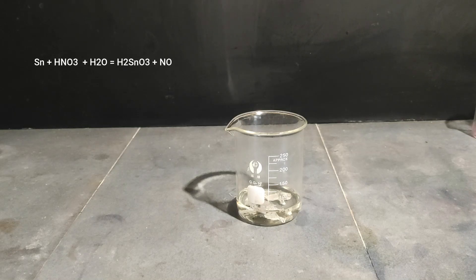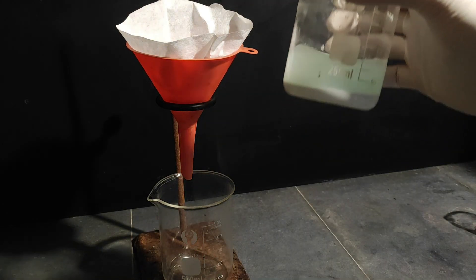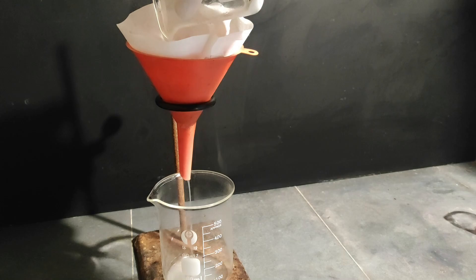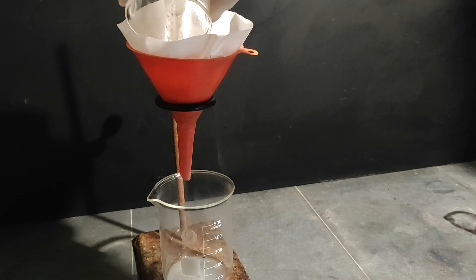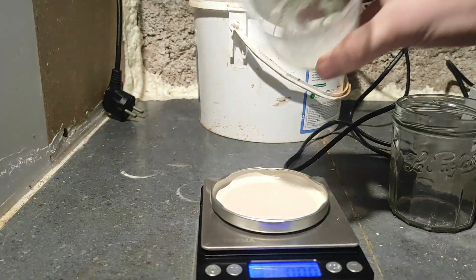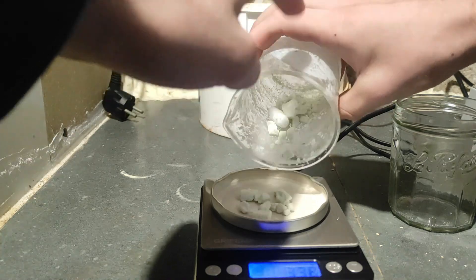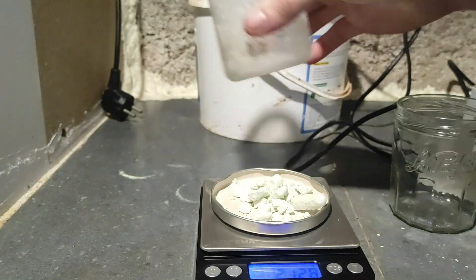The tin metal gets dissolved by nitric acid and forms a white insoluble solid called metastannic acid. The reaction is exothermic and produces lots of nitrogen dioxide gas, so make sure not to breathe it — do this outside or with good ventilation. When the reaction is finished, we are left with metastannic acid and a slightly blue solution due to some copper impurity from the solder. I filtered the metastannic acid and washed it multiple times with water. After drying at very low heat, we are left with 15.6 grams. Make sure not to heat it too much, otherwise it will decompose into useless tin dioxide and water.